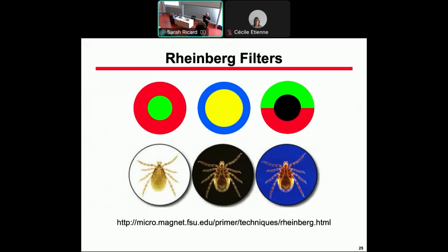The sample is embedded within the microcapillary, and you can rotate 360 degrees. In fact, it works, but it is very expensive. So there's lots of interest afterwards.